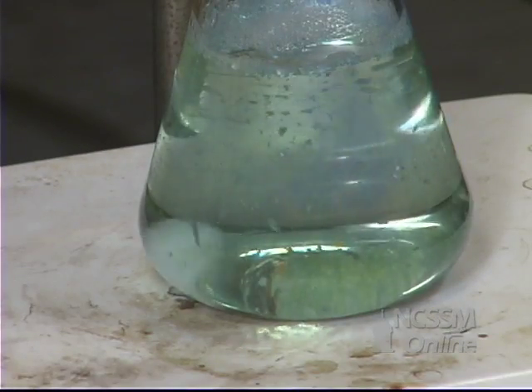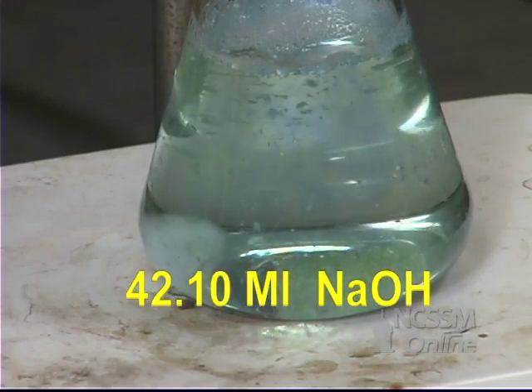The solution has now reached a pale blue endpoint. We'll take a final burette reading.